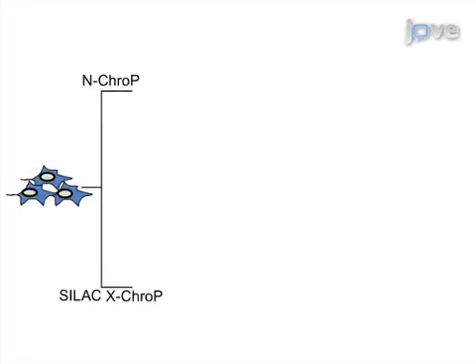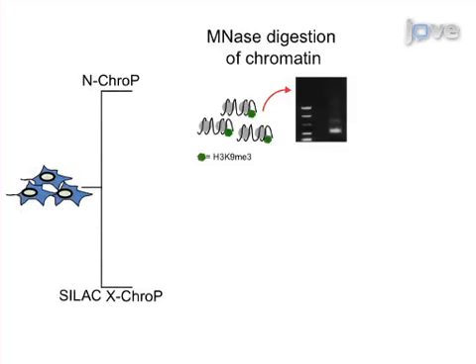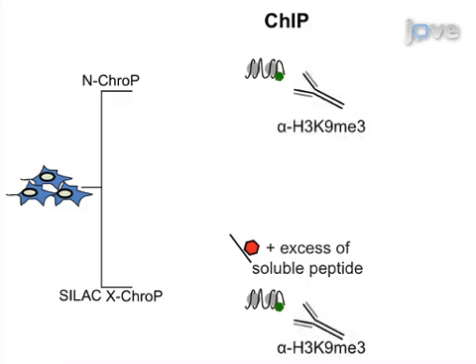This is accomplished by first preparing nuclei from cultured cells and digesting chromatin into fragments of optimal length through enzymatic or mechanical means. The second step is to purify a distinct functional domain from bulk chromatin by immunoprecipitation using bait antibodies against either a histone post-translational modification or a protein known to specifically mark the region of interest.